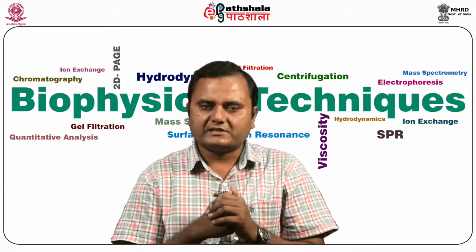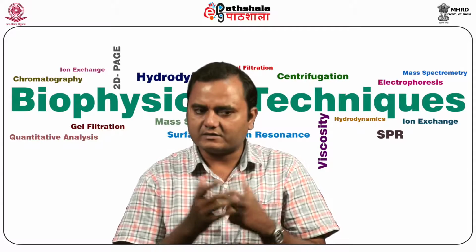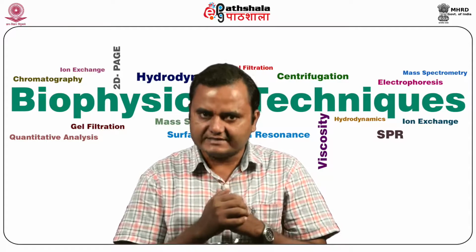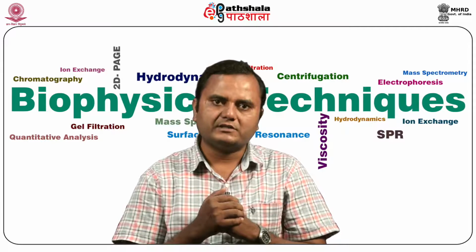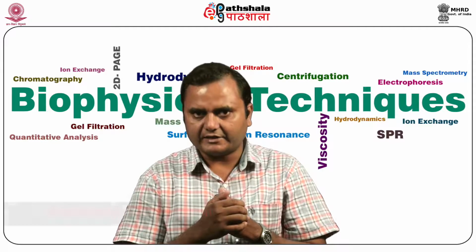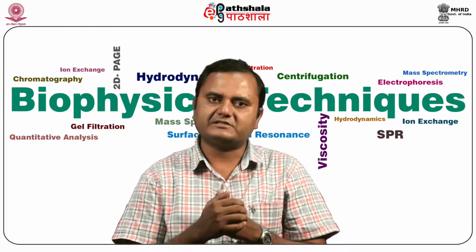Sedimentation of particles in a gravitational field is dependent on the mass of the particle, the density of the particle, or the size of the particle, but it is better explained in terms of the sedimentation coefficient, known as S. The S value is the sedimentation velocity of the molecule. This may be measured by sucrose density gradient sedimentation or by analytical ultracentrifugation. The S value of a molecule is determined both by its shape and its mass.